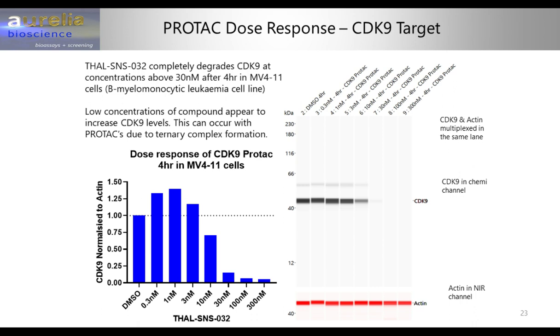That's an interesting point. We are running out of time, and so I think we just have time for one other question. And we have this one in, and perhaps this is one maybe more for Carsten to answer. And the question is, when there is interference among the antibody for the housekeeping protein and the target protein, is it acceptable if the housekeeping protein is run in the same sample in a different capillary?